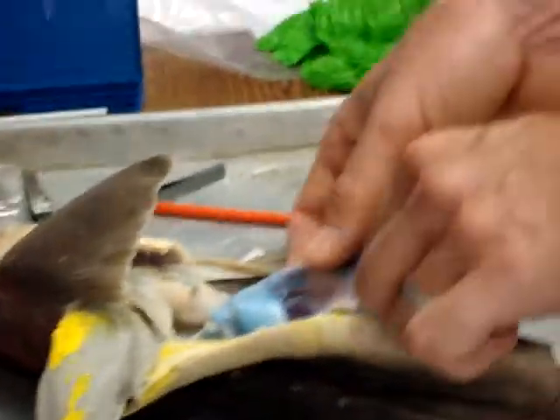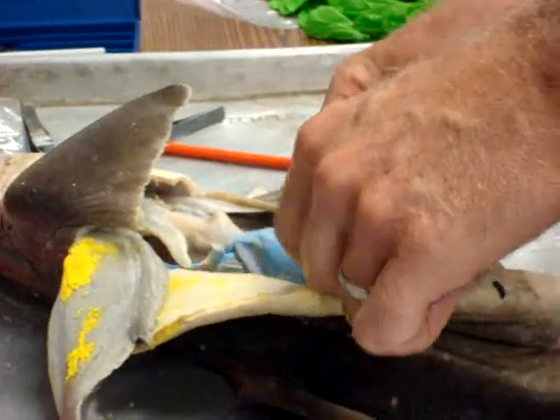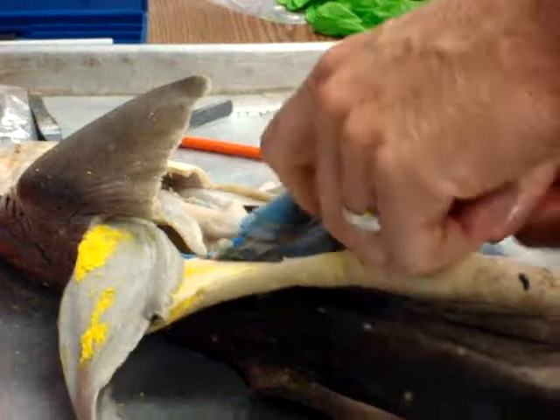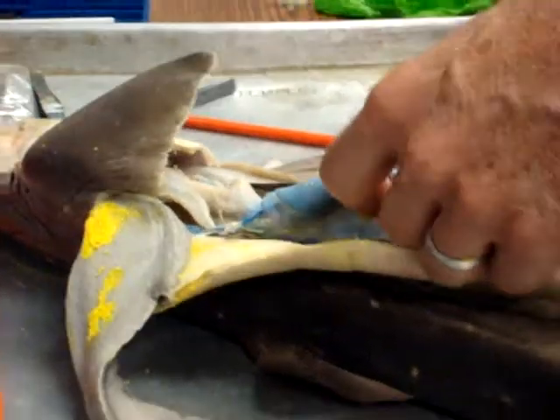Would the pancreas be this one? This is a pancreatic duct which runs into the duodenum. Duodenum. Okay, cruising down. Thank you, Mrs. Margraff. Oh, that's fresh. Yes, it is.